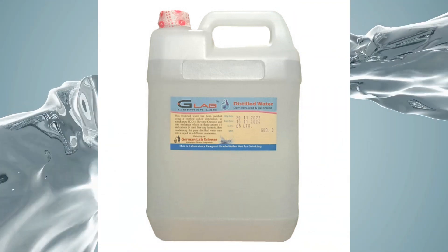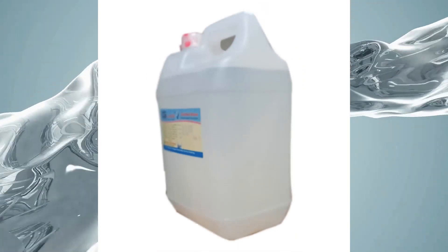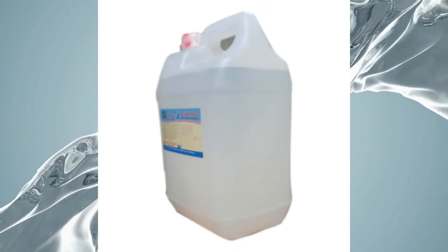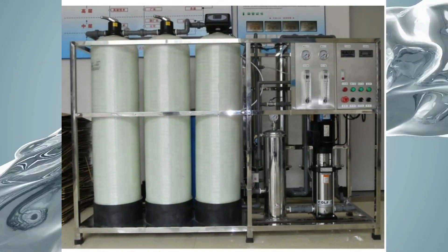Additionally, Grade 3 water is used in general laboratory applications such as buffer and pH solutions. It can also be used to feed other water systems, like laboratory taps.